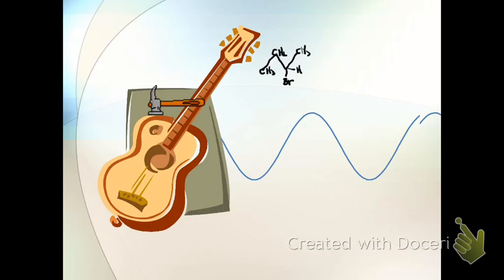You'd expect this in molecules that have symmetry, and there are a couple of rules that help us with this that we'll use later, where we look at the symmetry of molecules, and of the hydrogens on molecules, to determine whether or not the signals are going to be the same or different. But in this case, we will definitely have 4 different signals.